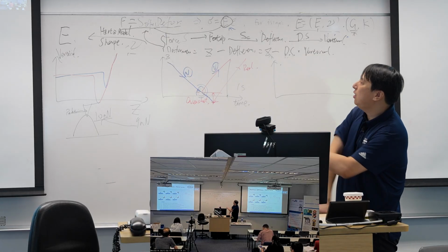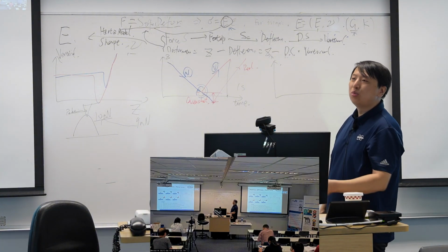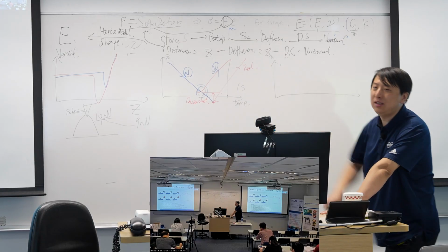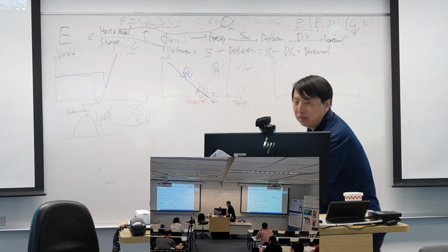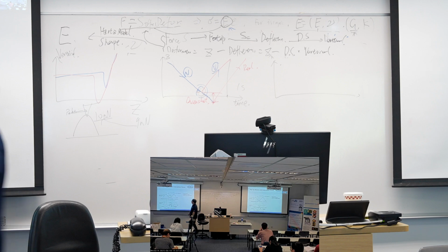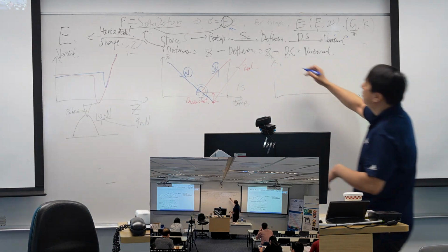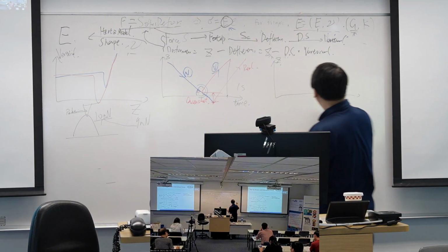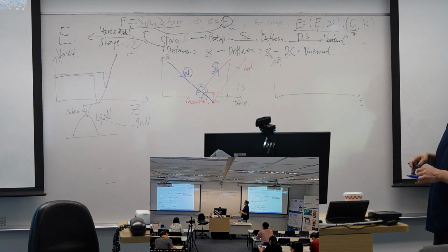If our velocity is a constant, of course we cannot do it. So we will do some movement with acceleration and deceleration. So the final solution is we're using the sinusoidal movement. With the sinusoidal movement, we write it down like this. This is the Z, this is time. So we make up a new movement.